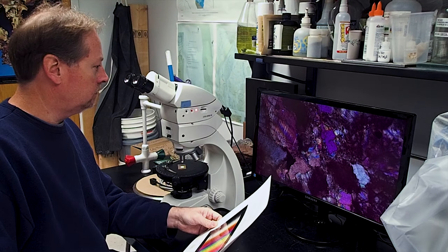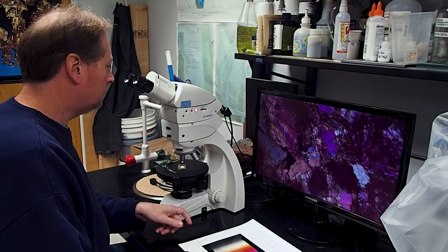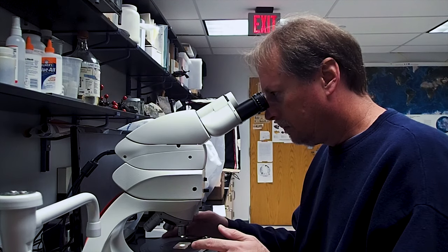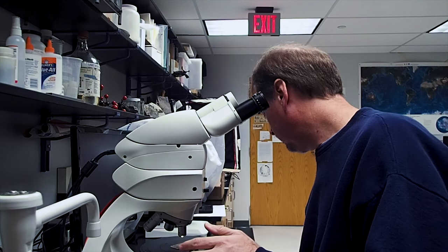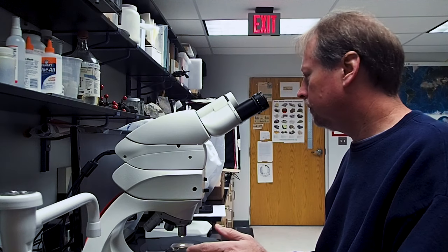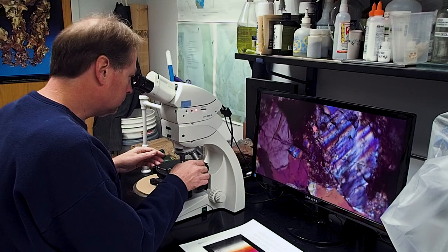The more practice and experience that you have with identifying minerals with a petrographic microscope, the easier this task will be. If you are just starting out learning to make thin sections, you may want to practice with samples that are known to have common or easily identifiable minerals in them when viewed beneath the microscope.